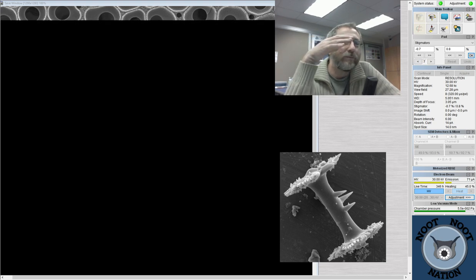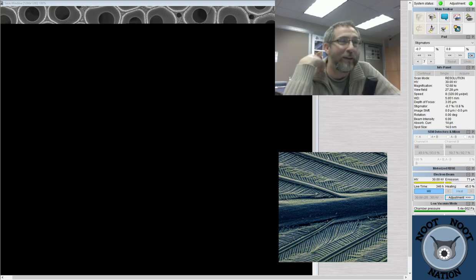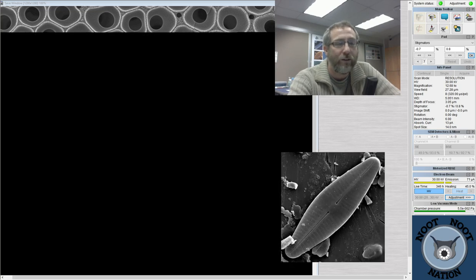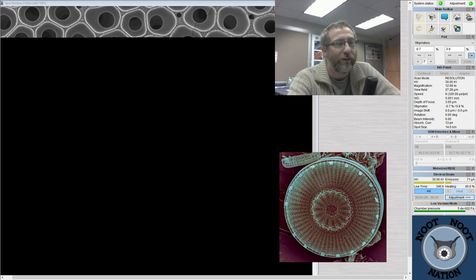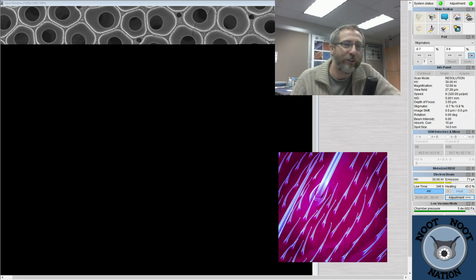Diatomite, which is from fossil diatoms. It's all collected from stuff that's super old. So, I mean, it's a rock when they mine it. So it's not like it's causing any problems to living organisms anymore. And they use it for toothpaste, which is one of the things that Pasta with Pizza brought up. But they also use it for wine and beer filters, and water filters will use diatomite. So I don't think we want to stop using it for that. And they use it for pool filters, like if you want to clean your swimming pool, because it's got all this intricate surface area, and it works really great for filtration.